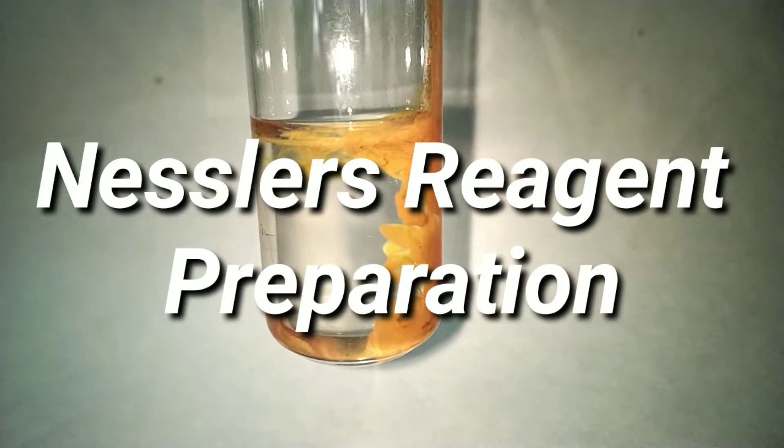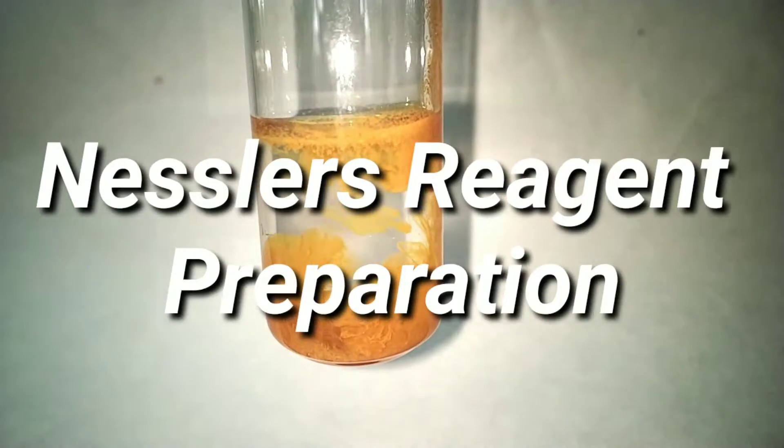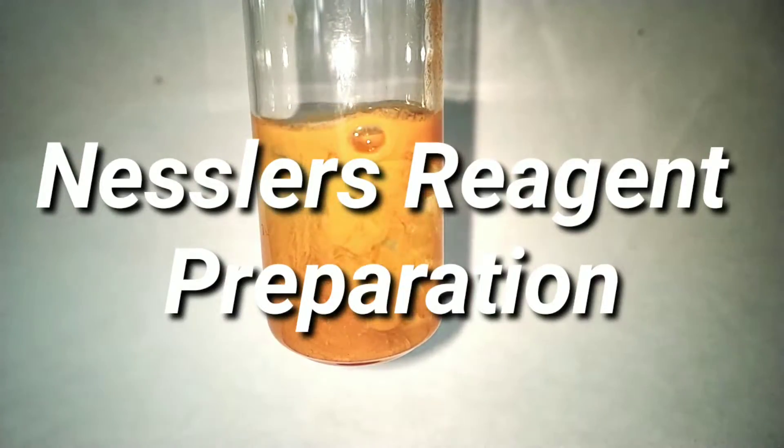Hello friends, in this video we will be preparing Nessler's reagent, which is used in qualitative analysis for the detection of ammonium ions in the lab.